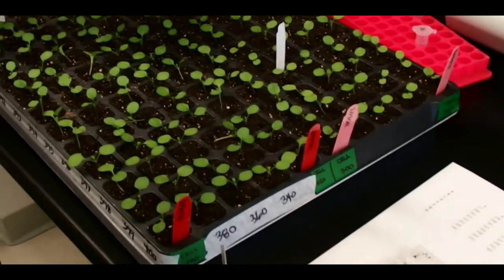And here she has a capillary tube. Why don't you show the vial? It came from this vial. It's a little piece of glass that will make a little punch.